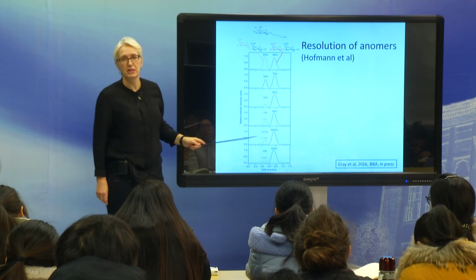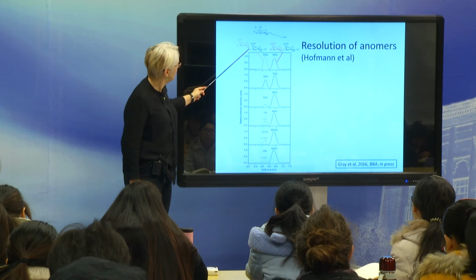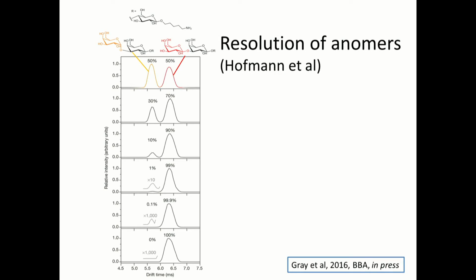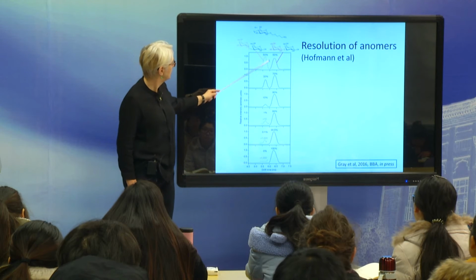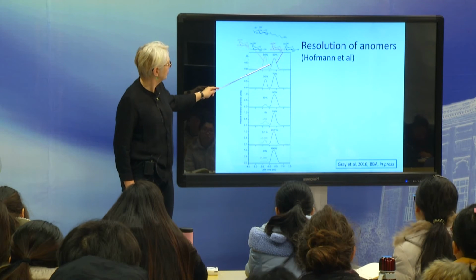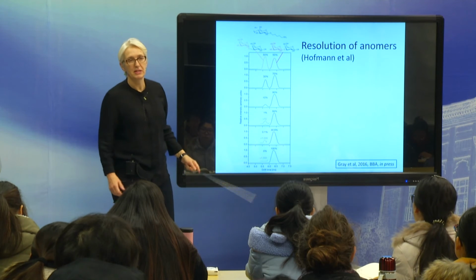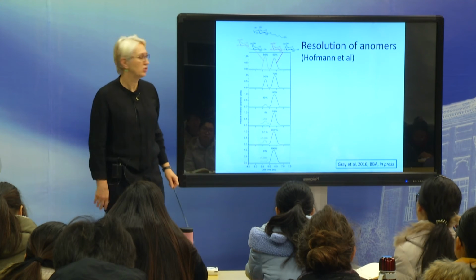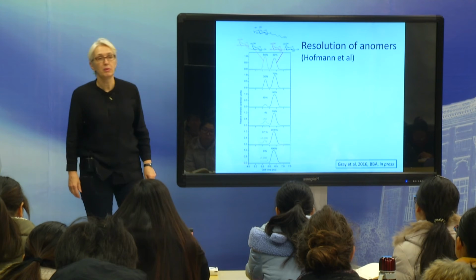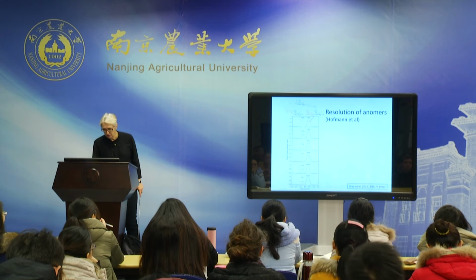So here they don't do any fragmentation, they just look at synthetic sugars, and they can only differ through the anomeric configuration. And you can see that, for those two, they get very, very nice separation in these measurements between two stereoisomers. You see very different types, and they can also quantify them because they get baseline separation. So I think this technique of ion mobility integration into mass spectrometry is getting more and more used now by people to look at really detailed stereochemical information of structure.